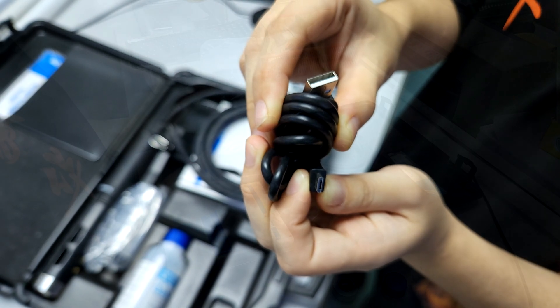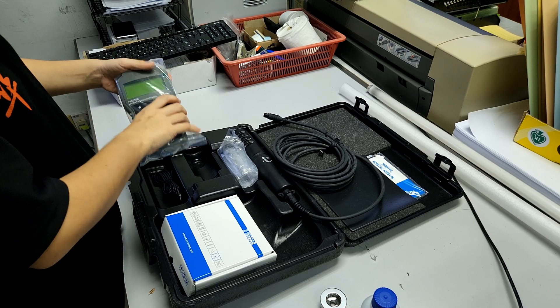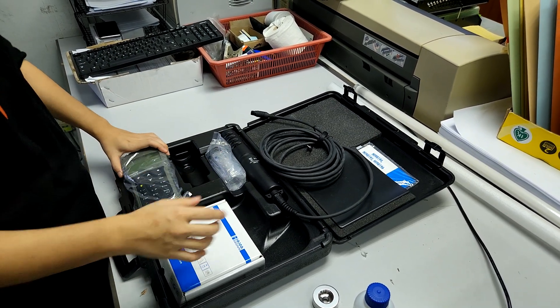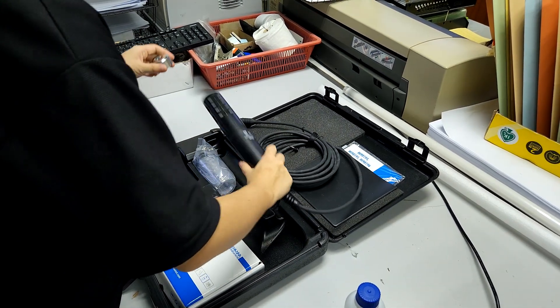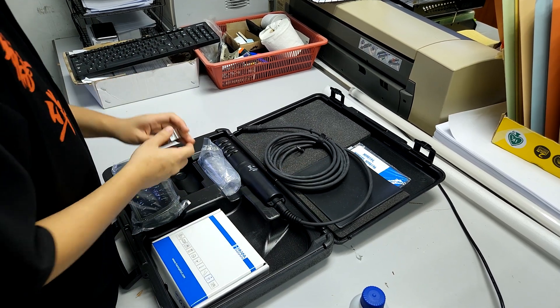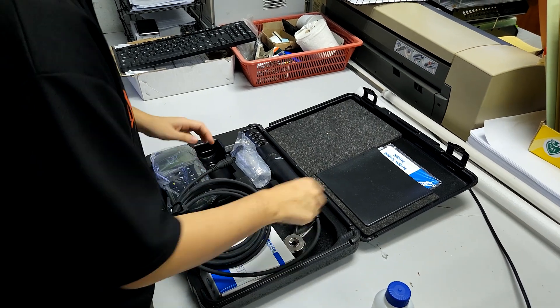So this is all we have for the latest probe unboxing. As you can see it's very comprehensive — it comes with all the necessary accessories and even includes a CD for installation to get the data out from the device. Hopefully you find this useful, as we realize there aren't a lot of models out there that can help you measure your DO and perform these kinds of measurements very accurately.